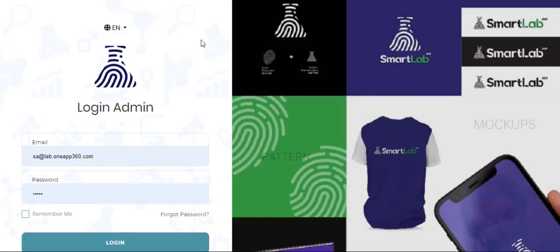Hello guys, my name is Moses London, and today we are going to be taking you on a SmartLab tutorial on patient registration. So, quickly showing you how to register a patient in SmartLab.